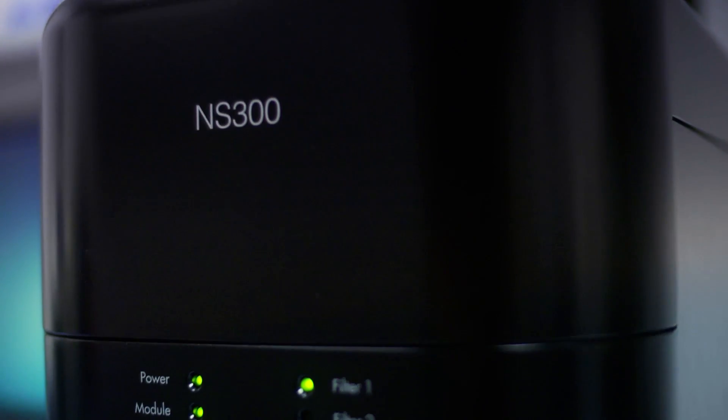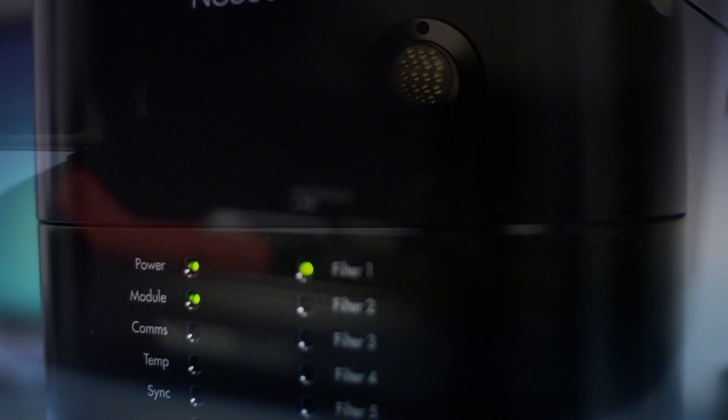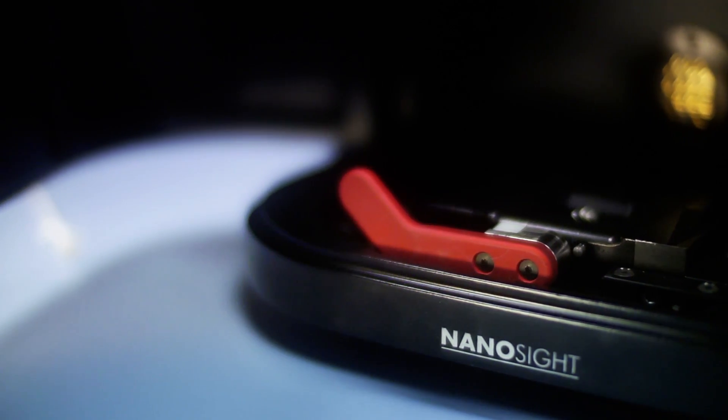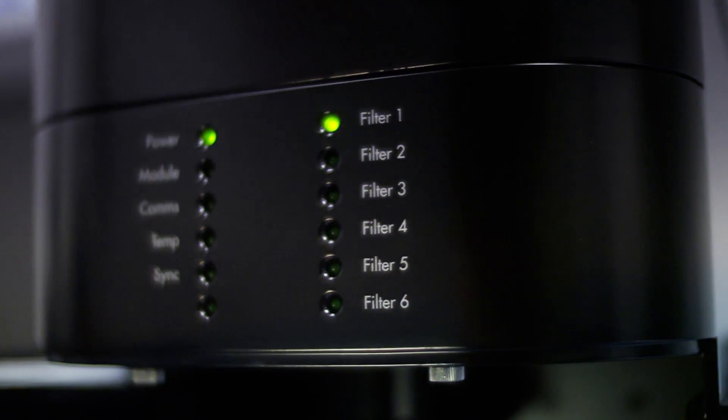The NanoSight NS300 from Malvern Instruments is capable of providing additional complementary information to that provided by Dynamic Light Scattering, or DLS.